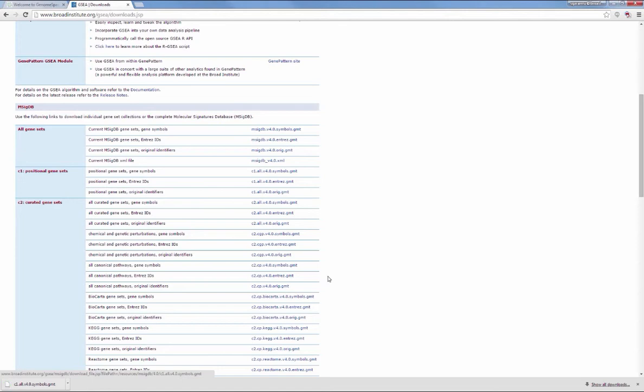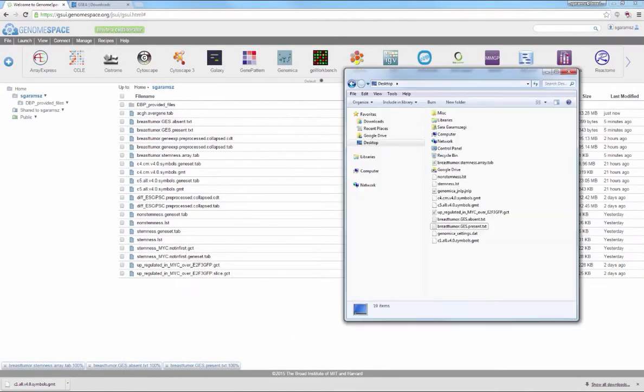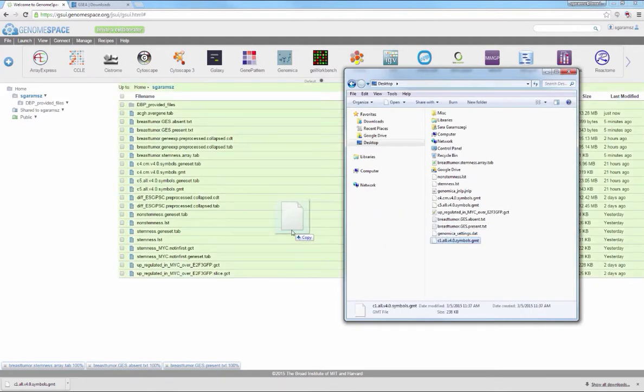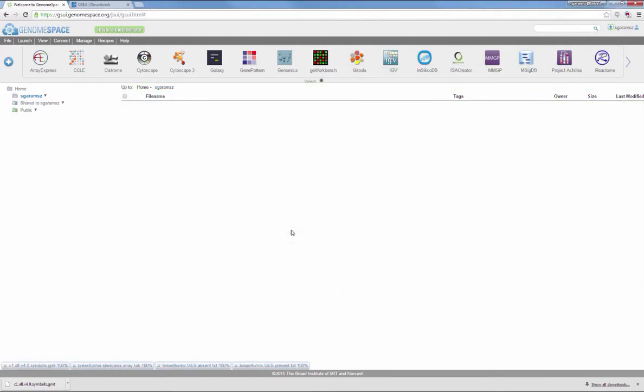Return to your GenomeSpace homepage. Click and drag the downloaded GMT file from your local file browser to your GenomeSpace directory.